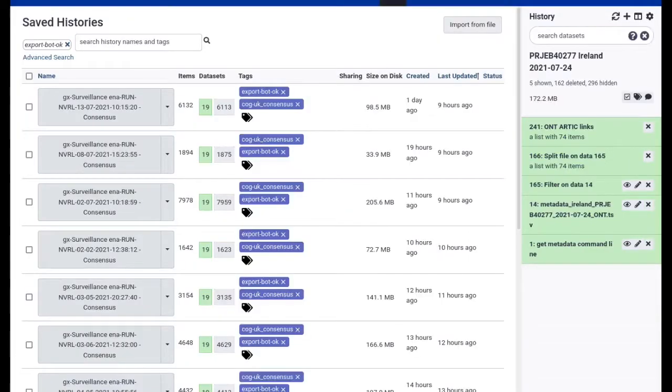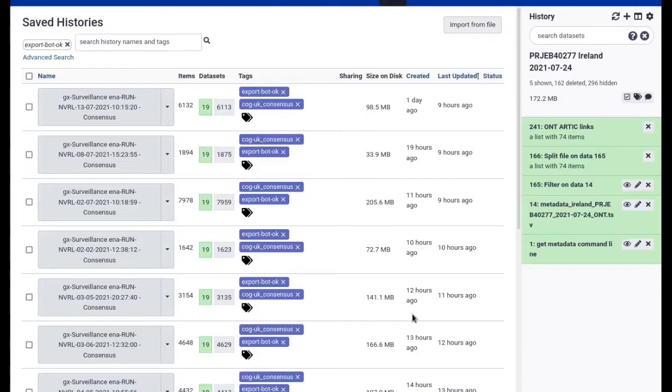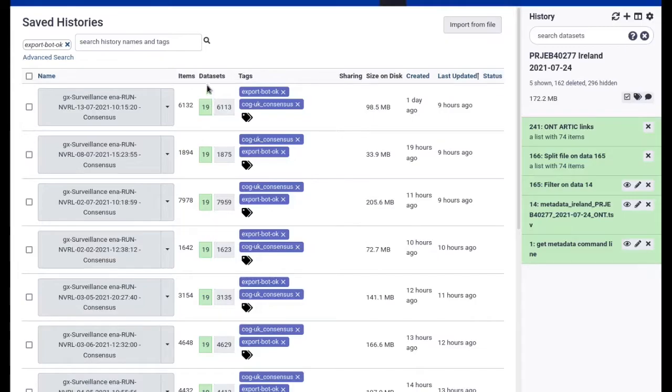Another issue is if the data you would like to download is not contained in just one collection. Let's imagine you've set up a SARS-CoV-2 genome analysis bot like the one running on usegalaxy.eu.